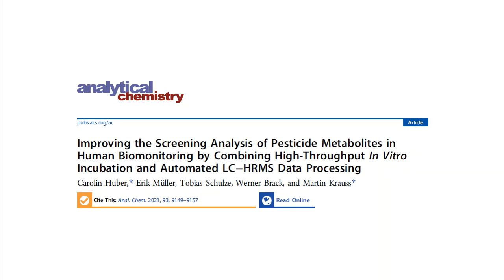In this video, I will analyze the MSMS data of a metabolite of the fungicide fenpropimorph, MassBank HB002861. Huber et al. had already determined that this metabolite had gained one oxygen atom relative to fenpropimorph. Our objective here is to determine where that extra oxygen was added to this compound.